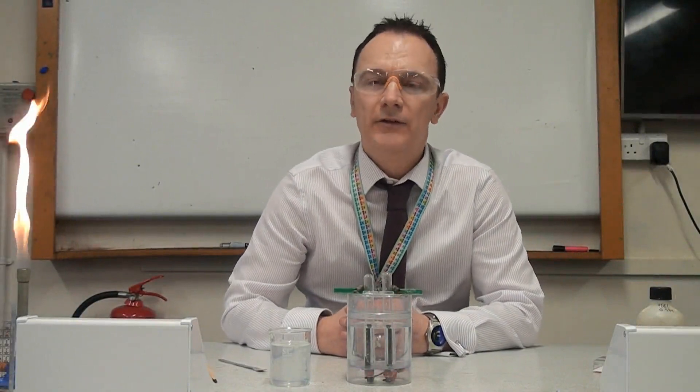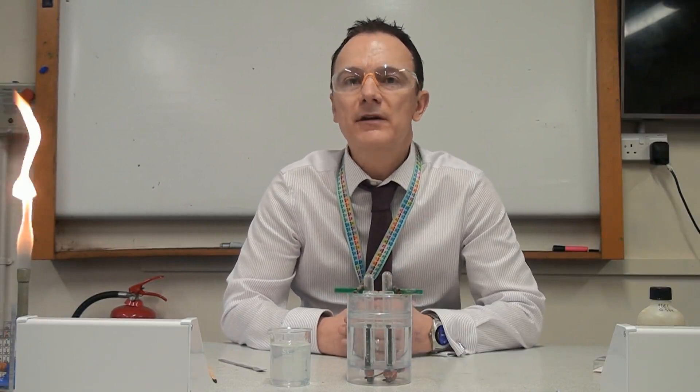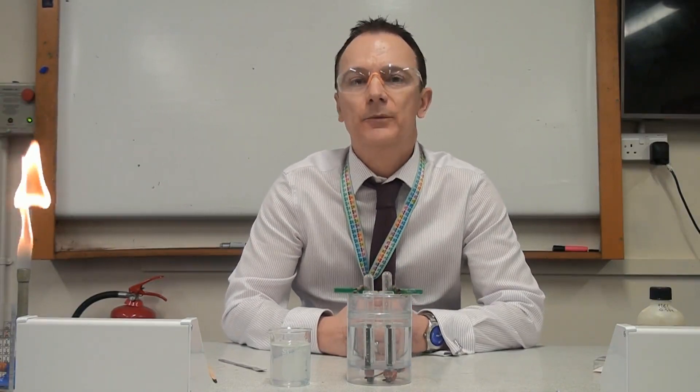Now we can see the lime water has clearly gone milky with the carbon dioxide passing through it. The last gas test is for chlorine gas, which I've generated by doing electrolysis on a solution of sodium chloride. If you've forgotten how to work out the products of electrolysis, check out my previous video.